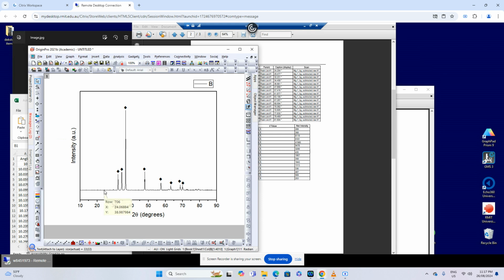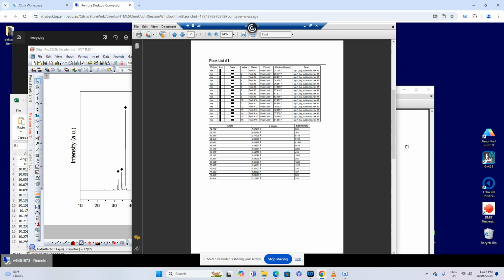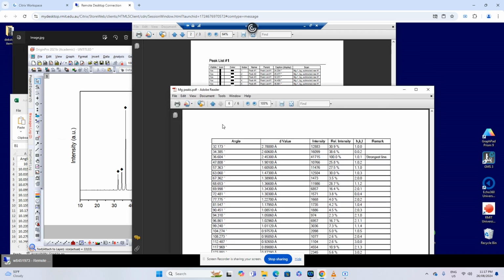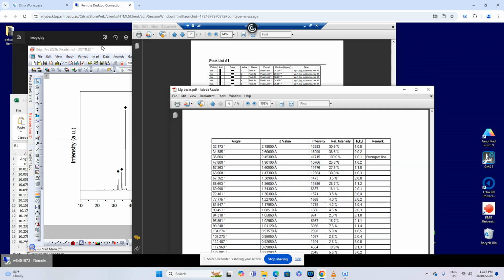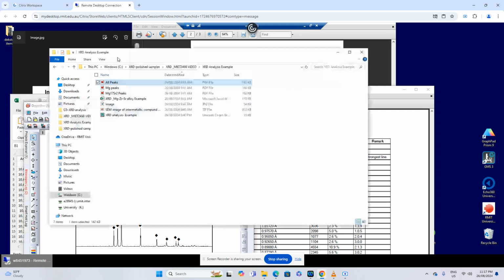All right. And one more thing, we can see that we have two small peaks here, around 24 degrees. The magnesium peaks here are not coming from 24, so we have to look at the other phase as well. If I go back to my folder here, we can see that we have another phase, magnesium 17 strontium 2.